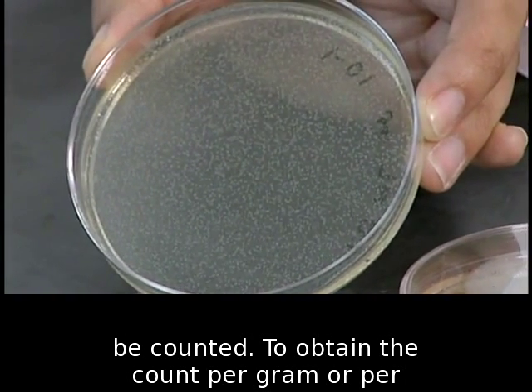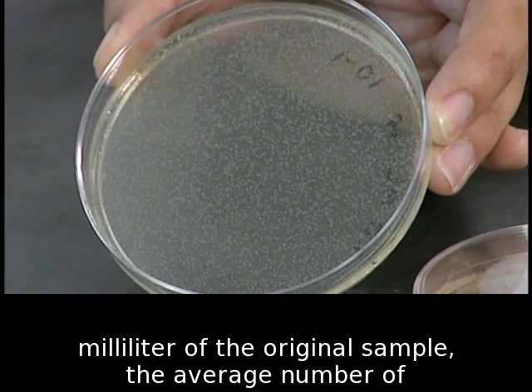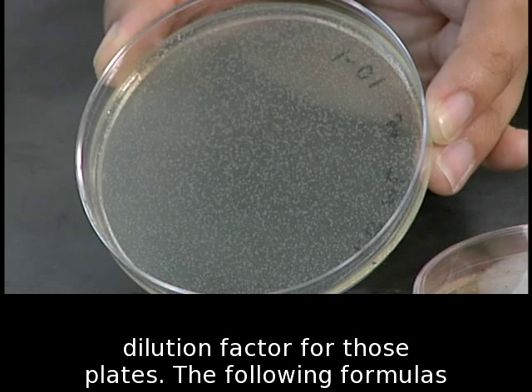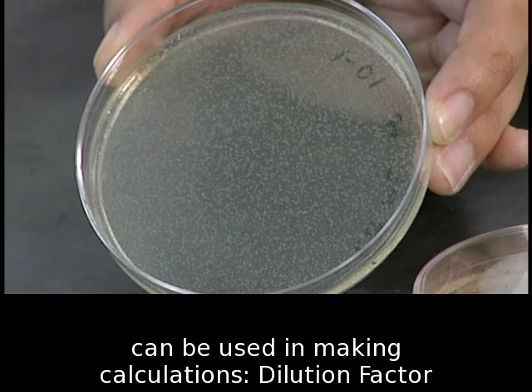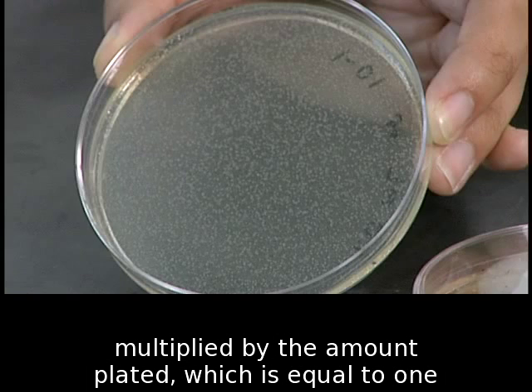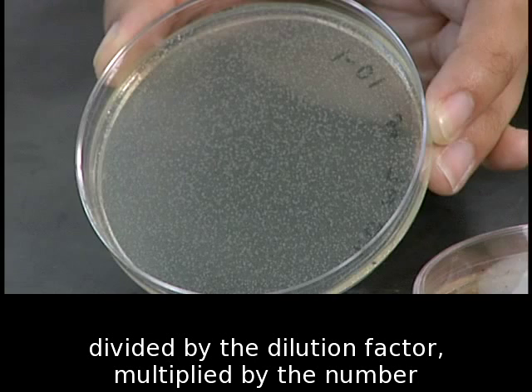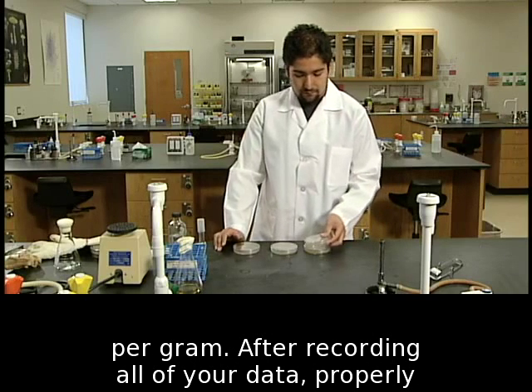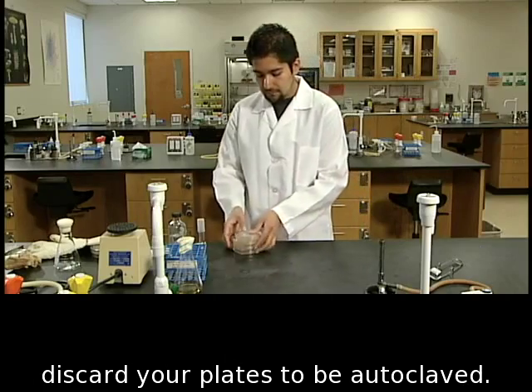To obtain the count per gram or per milliliter of the original sample, the average number of colonies per plate is multiplied by the reciprocal of the dilution factor for those plates. The following formulas can be used in making calculations. Dilution factor equals initial dilution multiplied by subsequent dilutions multiplied by the amount plated, which is equal to 1 divided by the dilution factor multiplied by the number of colonies counted equals the colony-forming units per gram. After recording all of your data, properly discard your plates to be autoclaved.